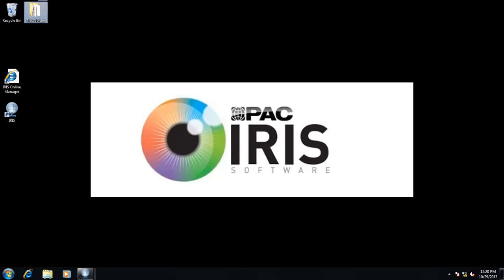Introducing Iris, the newest software offering for laboratory automation from PAC. Iris is the first system designed and developed by PAC to unify our brands by allowing one system to function across all PAC brands, including ISL, Herzog, Alcor, Antec, and AC Analytical Controls.